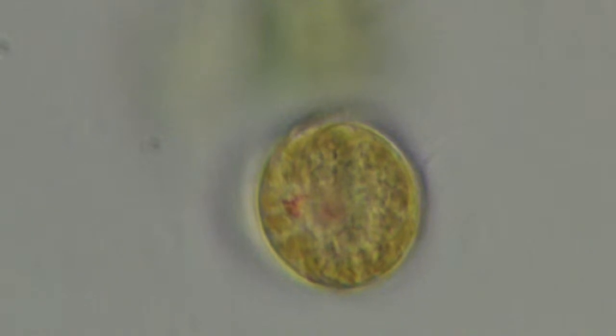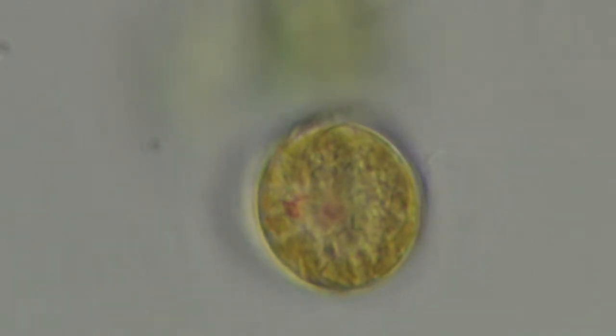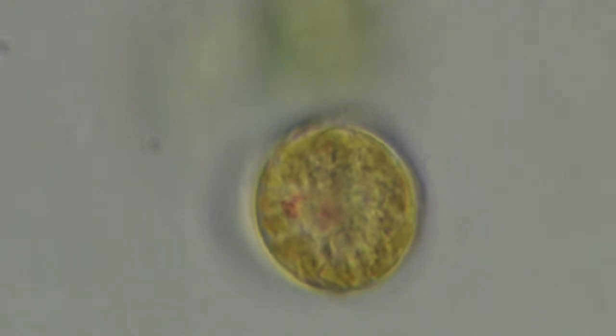Dinoflagellate. And you can see the flagella. So there's the flagellate part. I forgot what dino is. Might be because they have two flagella. I can't remember. But they're interesting because the flagella come out of this waist structure, this little groove they have. It's like a giant Death Star trench around the middle of the ball of the shell, essentially.